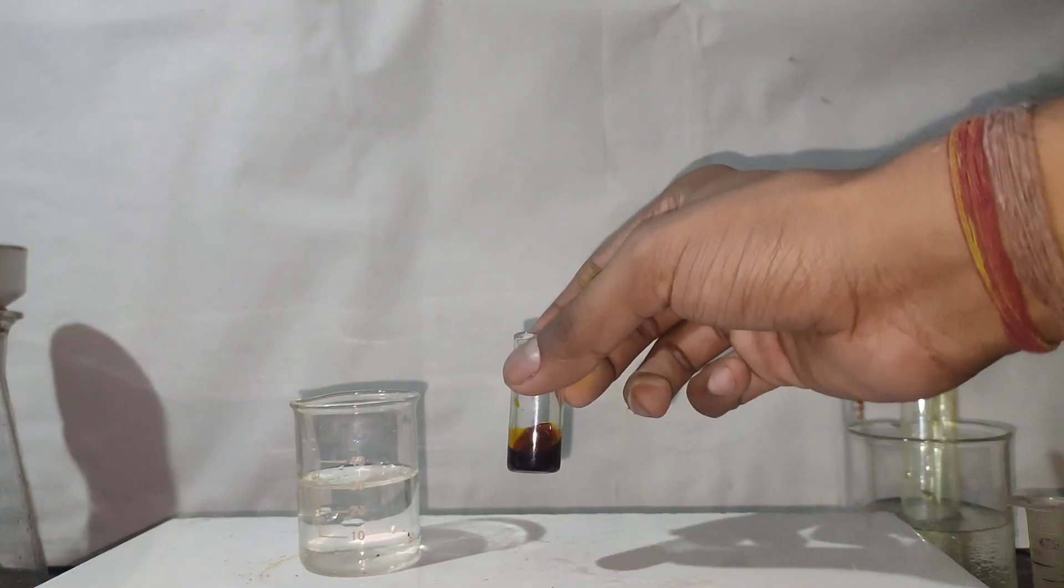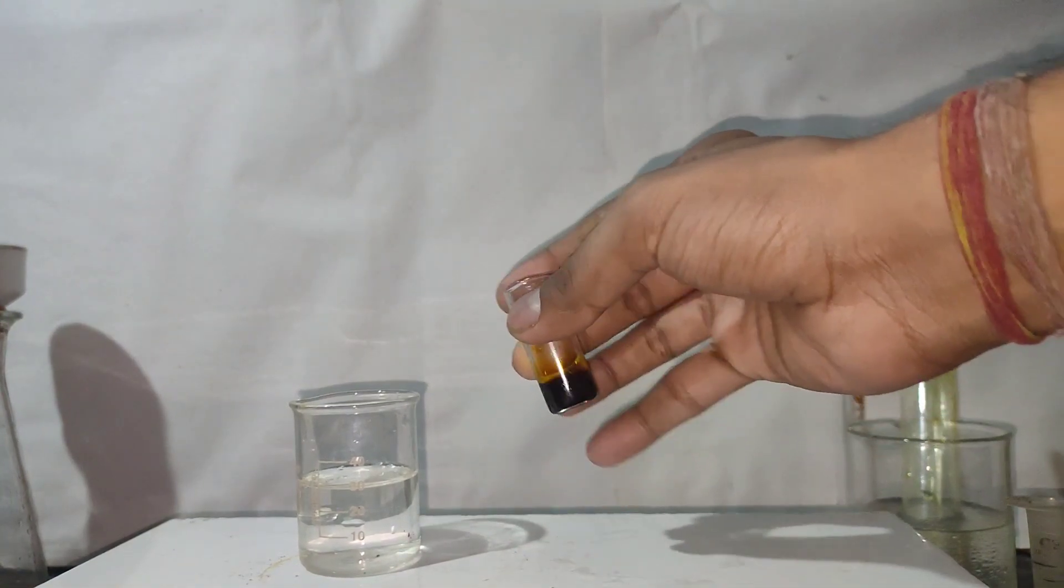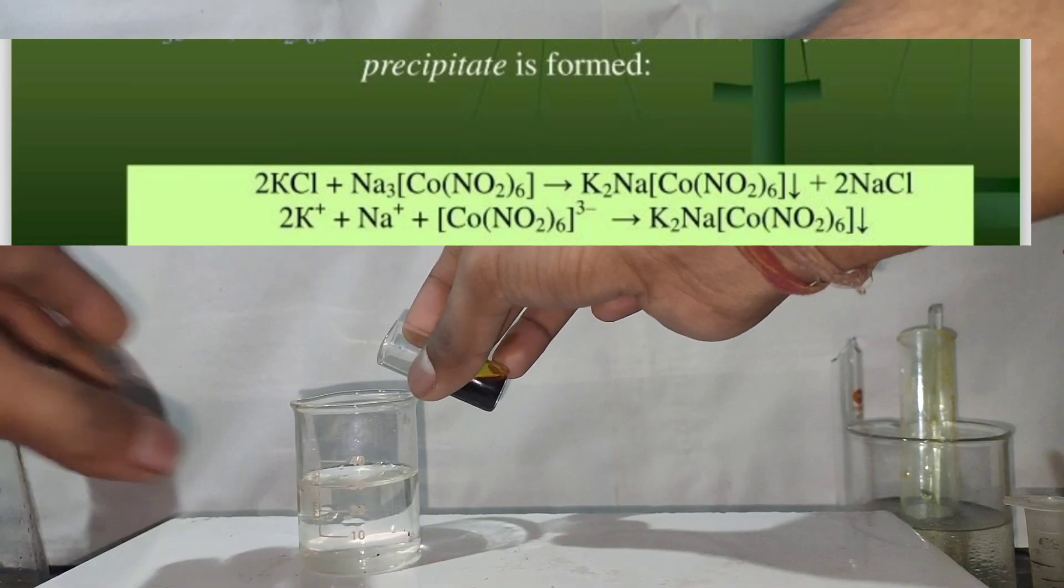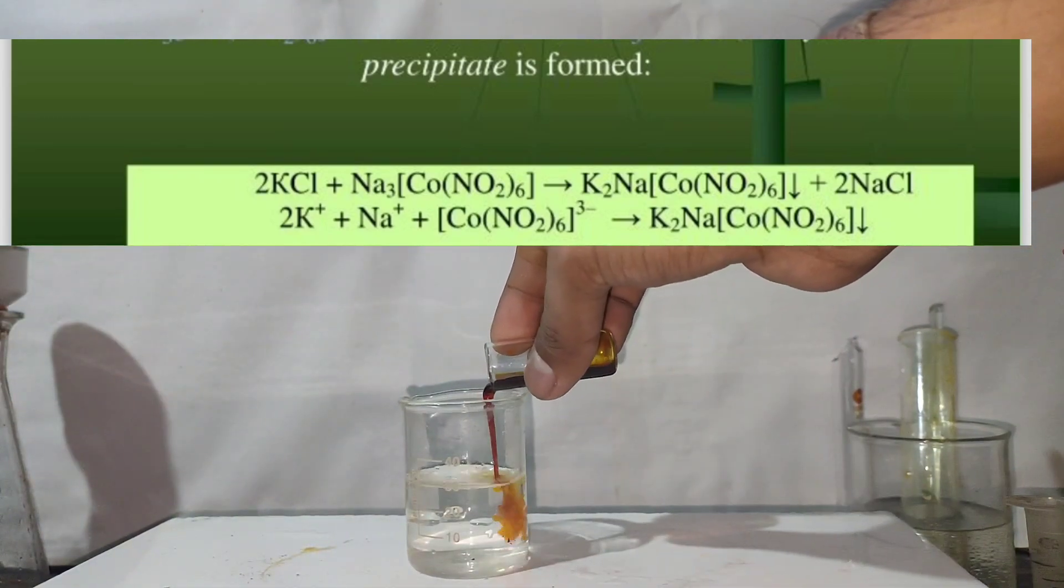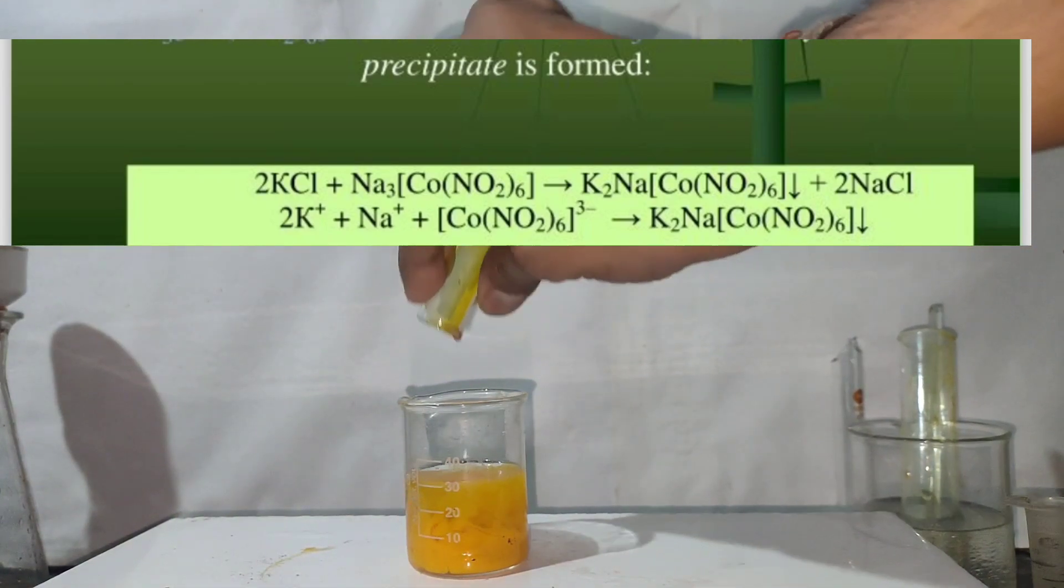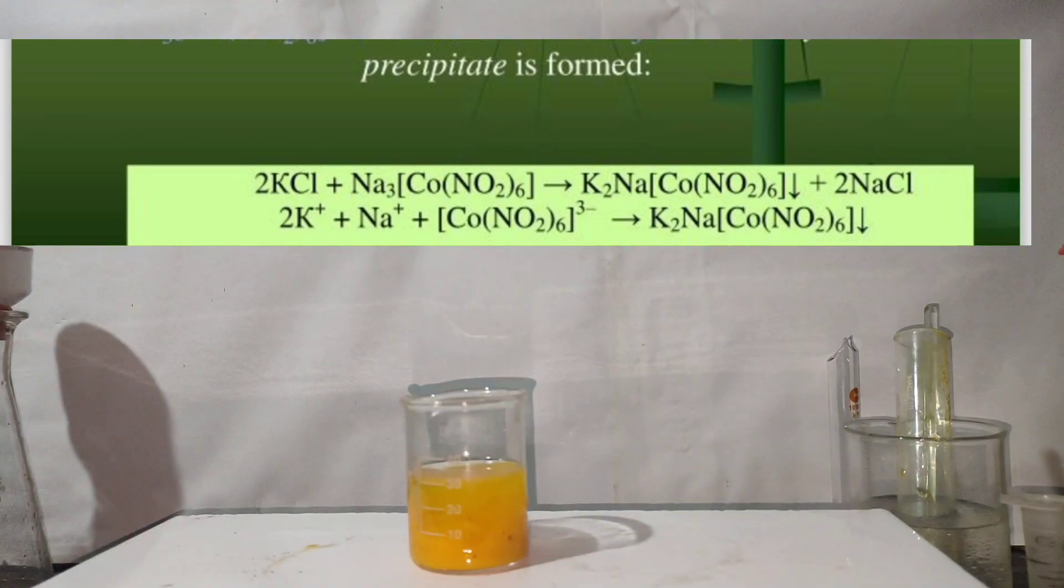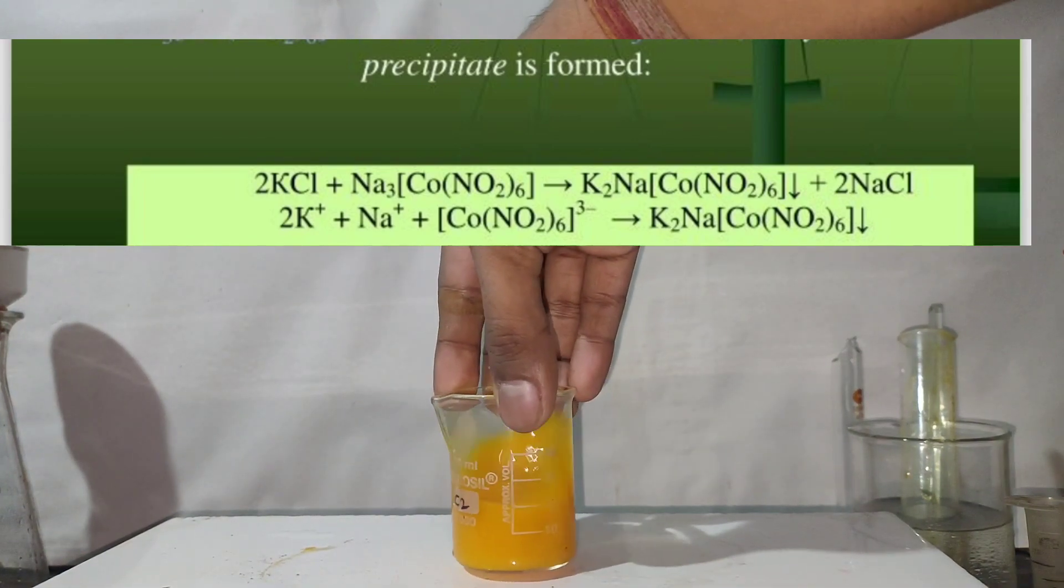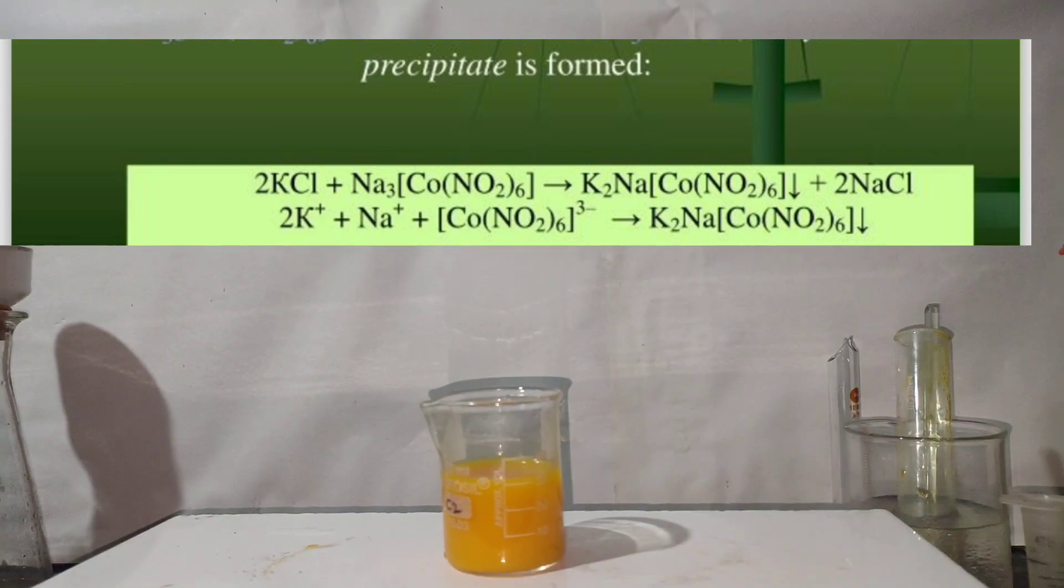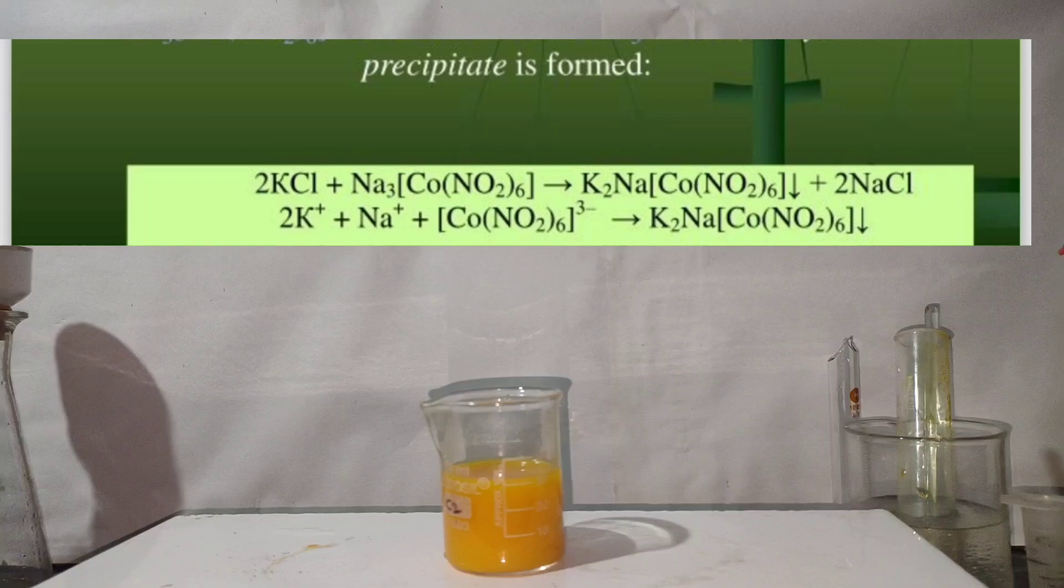Here in the beaker, I have a solution of potassium chloride. To it, I will be adding sodium hexanitrocobaltate solution. On adding it, immediately you can see the formation of a yellow precipitate. This precipitate is sodium potassium hexanitrocobaltate 3. Thus, this reagent can be used to detect the presence of potassium ions in solution.